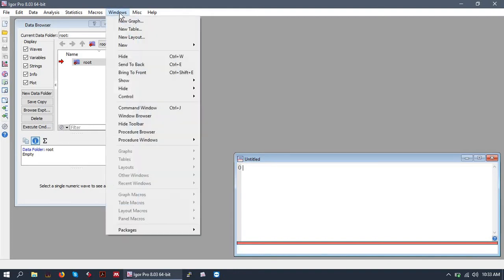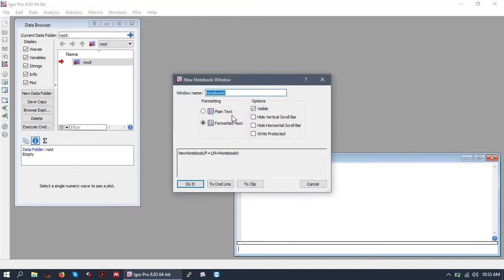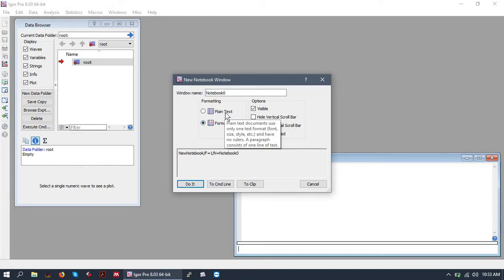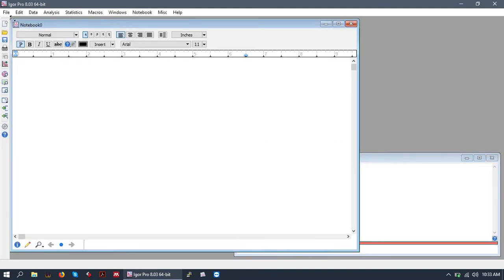Next, let's open a notebook. So we'll go to Windows, New, Notebook. We have some options. We can do a plain text or a rich text formatted, and that includes images notebook. So let's go ahead and do a formatted notebook to make things prettier.